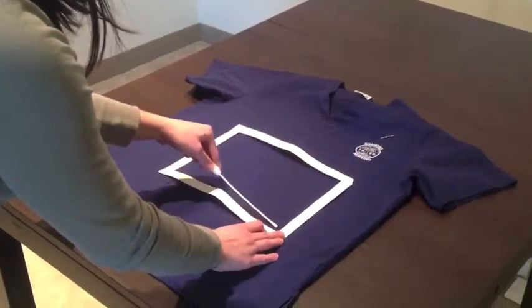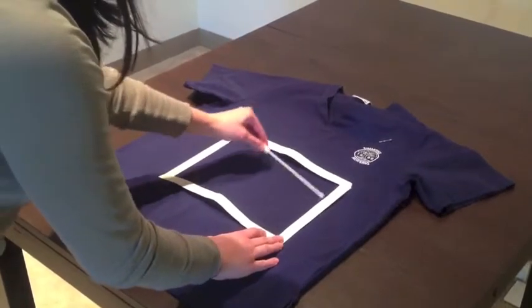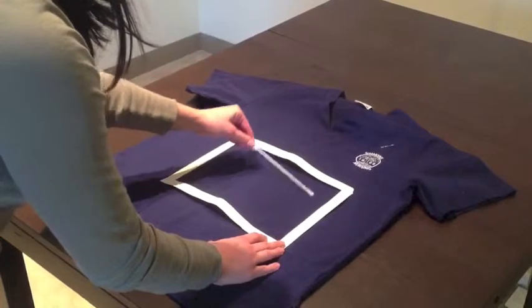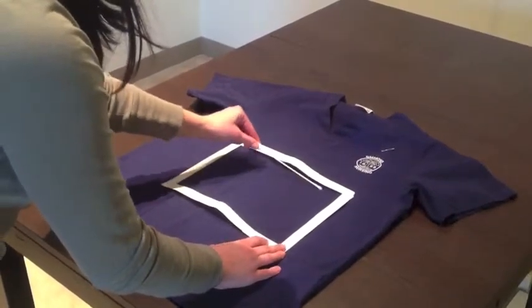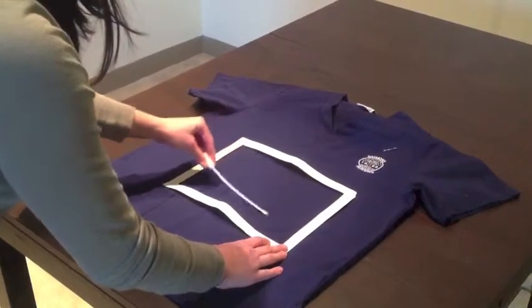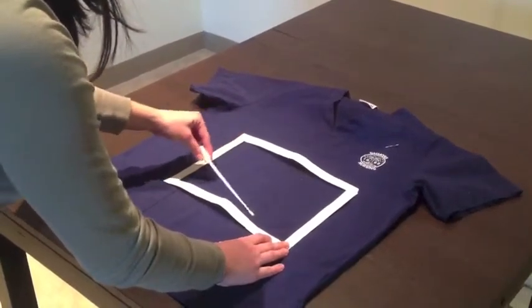To swab every square inch when you are at the bottom right, move the swab from top to bottom, rolling the swab in between your fingertips. Again, it is important that you do this slowly and carefully to swab every square inch within the template. Do not rush this step.